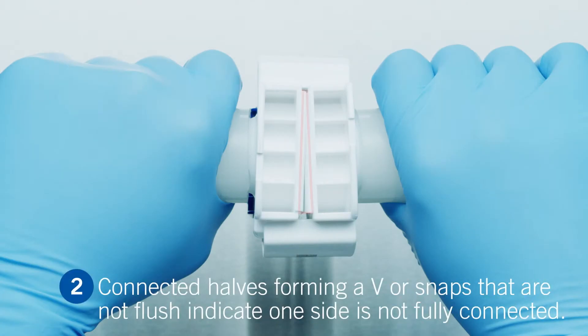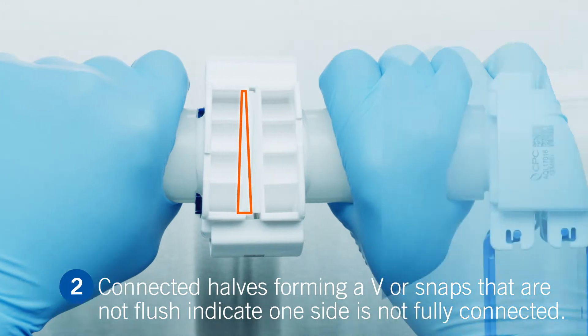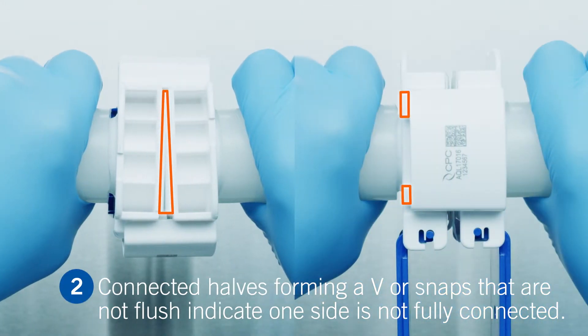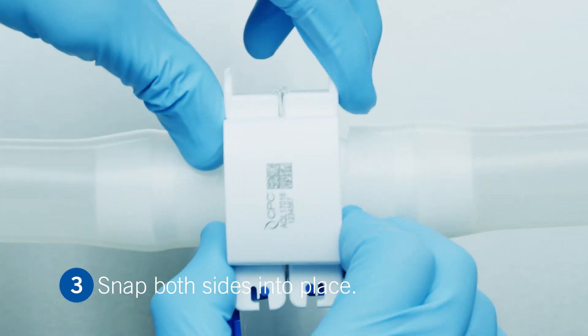If you can see the connector halves forming a V, or that the snaps are not flush with the back side of the connector, this means both sides are not fully connected. Just snap both sides so they are parallel.